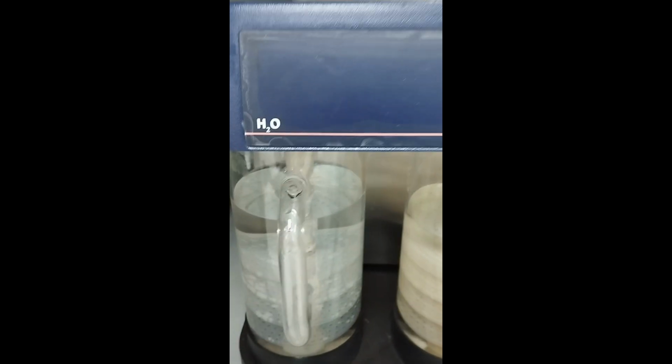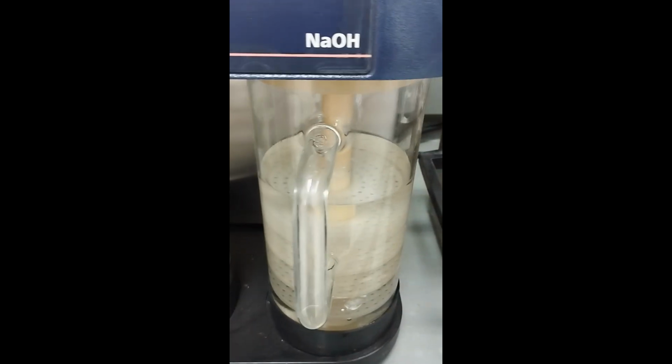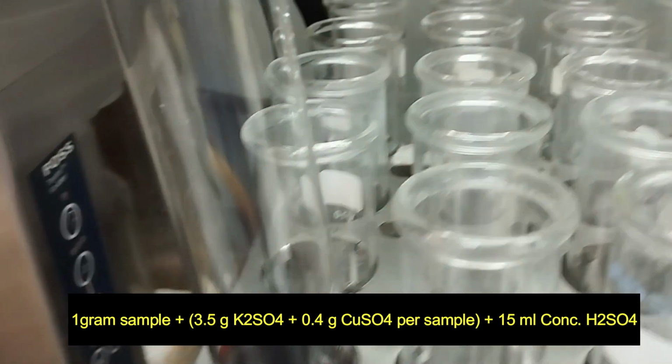And coming towards this chamber, first of all, this one is H2O and this one is sodium hydroxide. As I have my sample in this, first I weigh my sample and then I put in this copper sulfate and potassium sulfate. You can see right now.